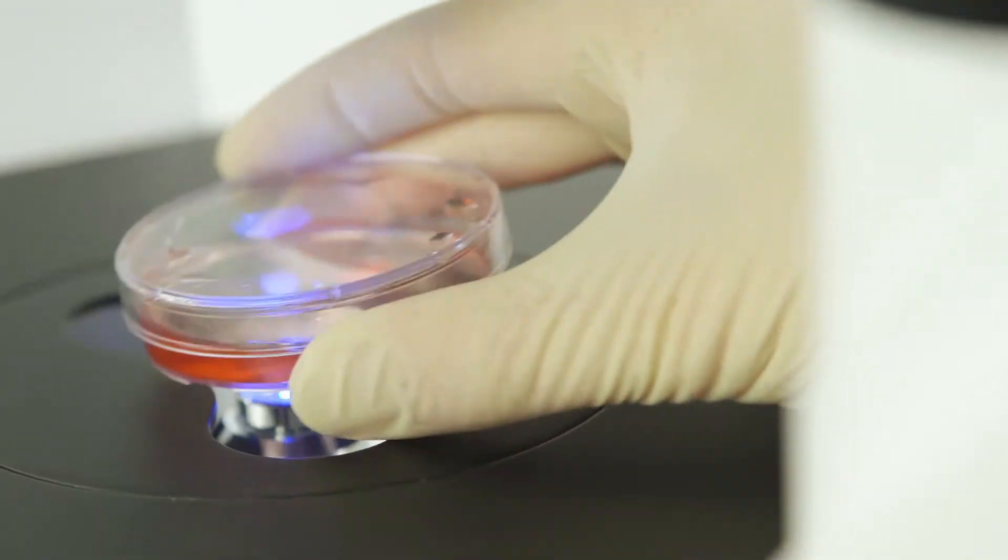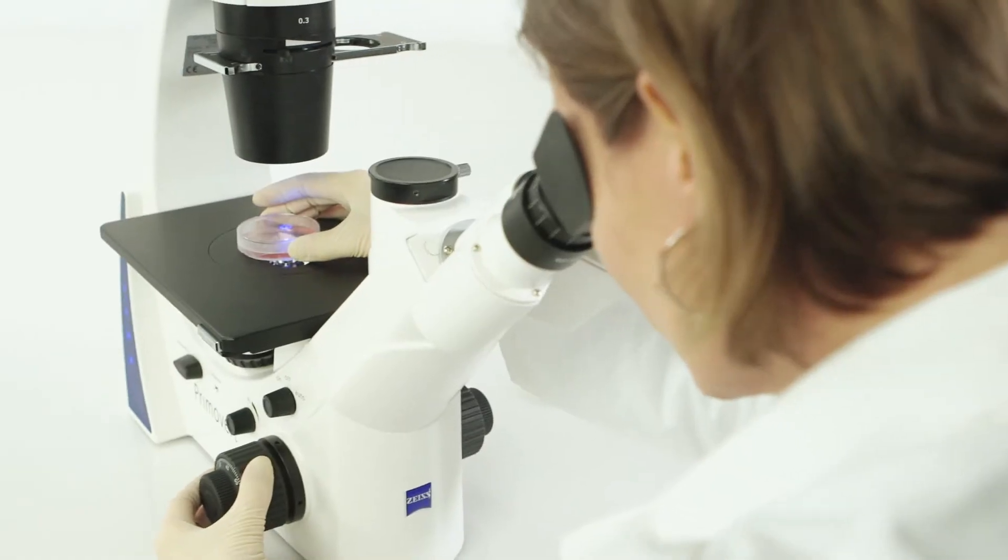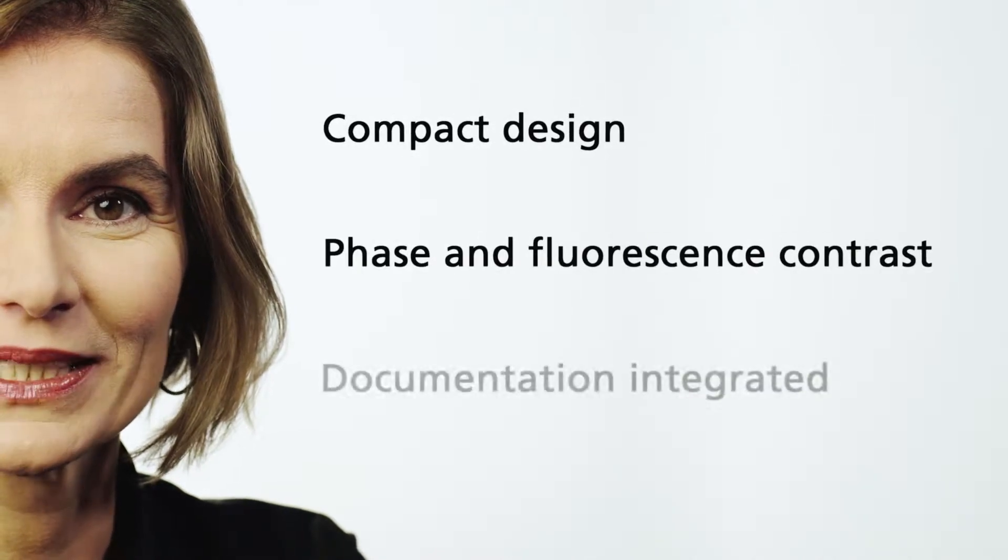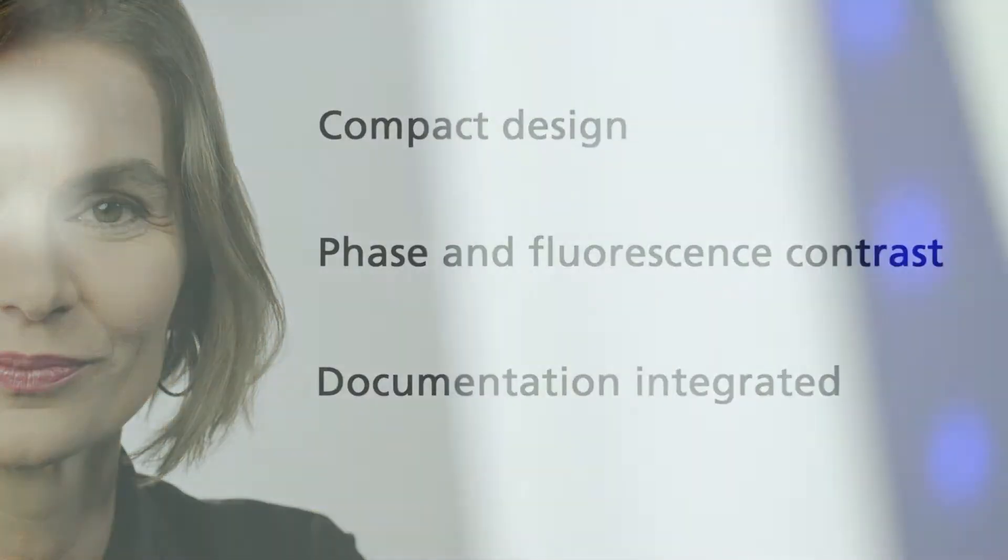For seven years now I've been dealing with microscopes for both the lab and education. In the course of many discussions you've let me know what you need and want for your work with cell cultures.